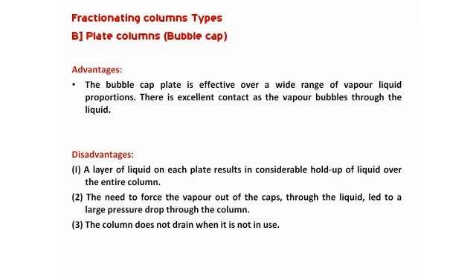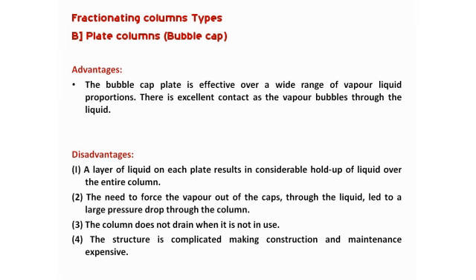The column does not drain when it is not in use. And the structure is very complicated, making the construction and maintenance very expensive.